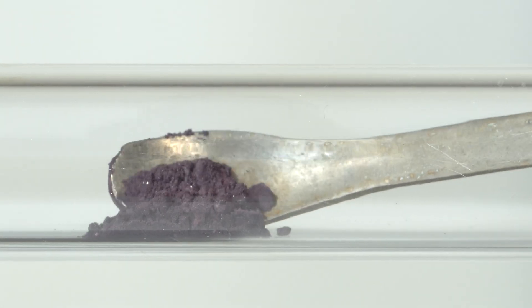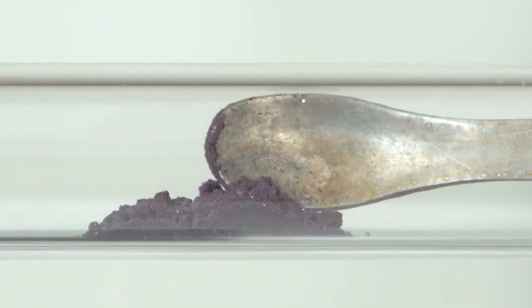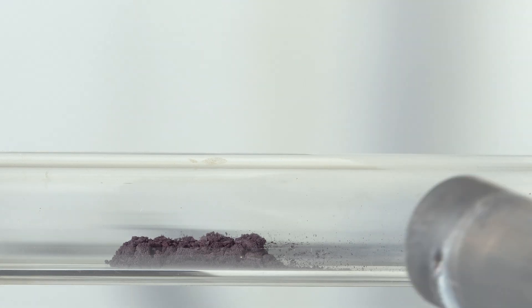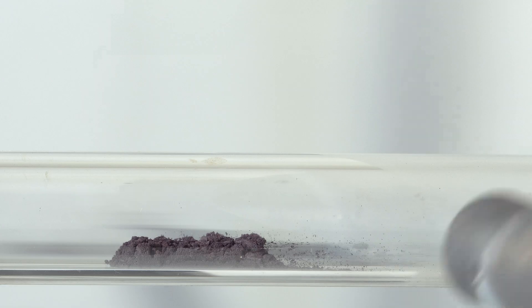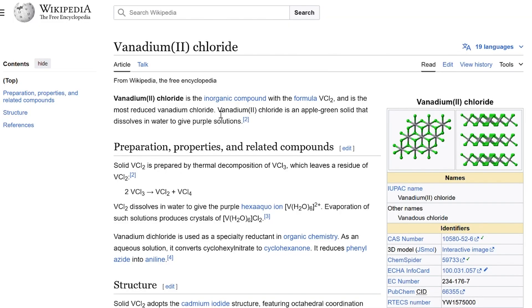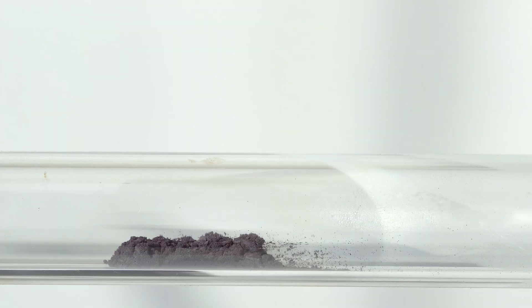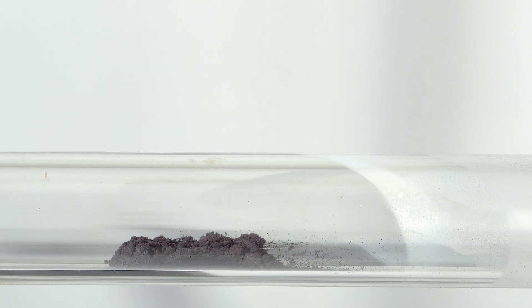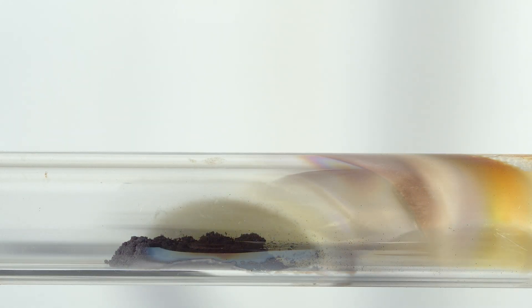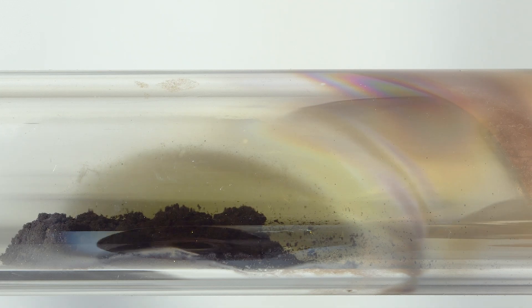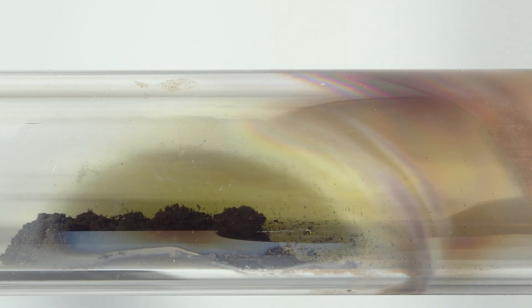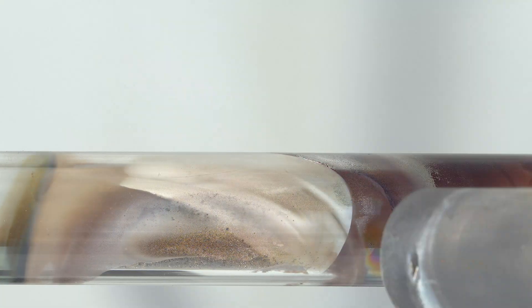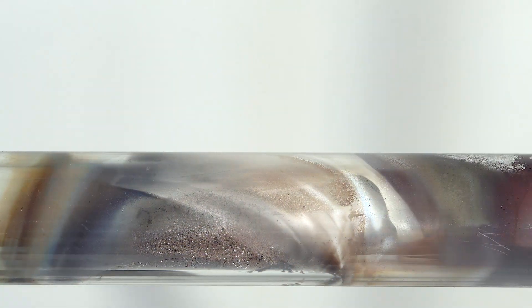If we heat this powder in a stream of hydrogen, then as a result of this reaction we will obtain, as stated in Wikipedia, apple green vanadium dichloride. Also, as a result of a competing reaction, vanadium trichloride will be reduced to metallic vanadium, leaving a vanadium mirror on the walls of a quartz tube.